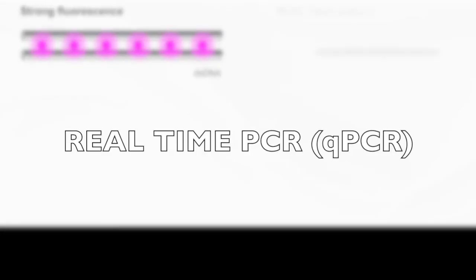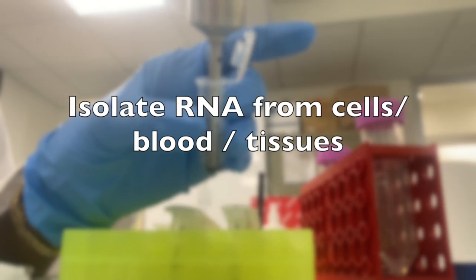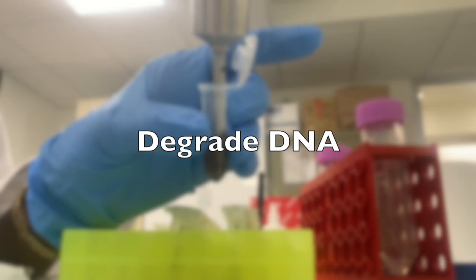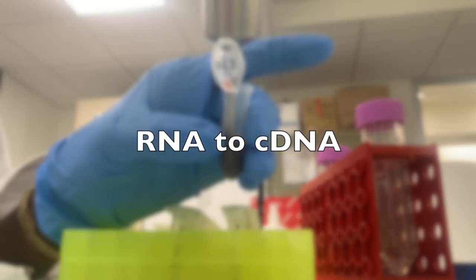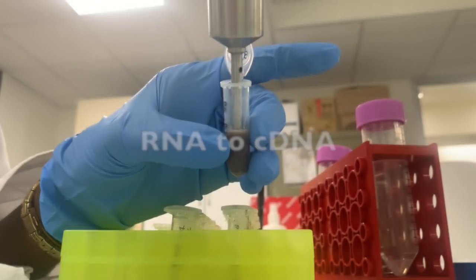Real-time PCR, which tends to only give you one gene or a handful of genes, has a workflow that is similar at the foundation. So you have to isolate the RNA from your samples, then you will remove any residual genomic DNA. You will have to convert your RNA into cDNA. Once you have cDNA, you'll be able to perform the actual qPCR. Are we on the same page?